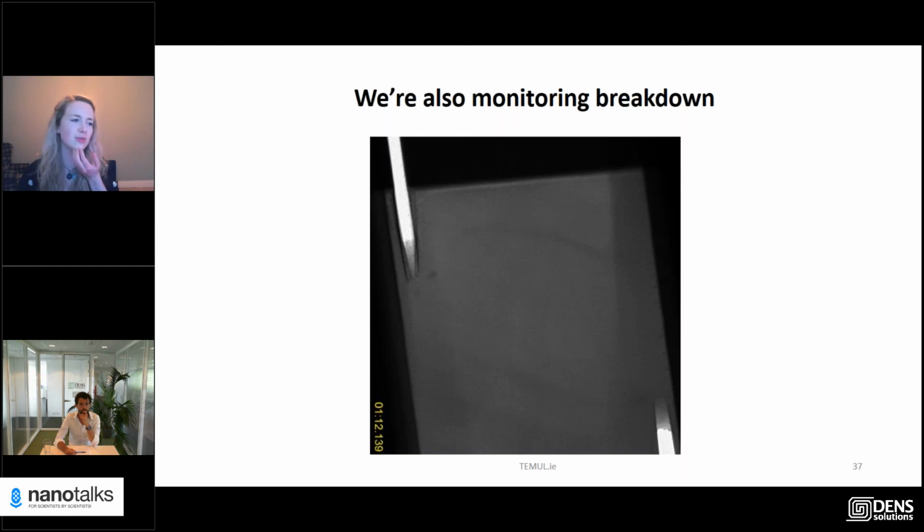It would be great to start making patterns in the FIB lamella itself. I know some people for ferroelectrics use the FIB in the bulk material to make a spiral or a square, and then within that region they get really unusual domain wall patterns or domain patterns. So that would be the next step.